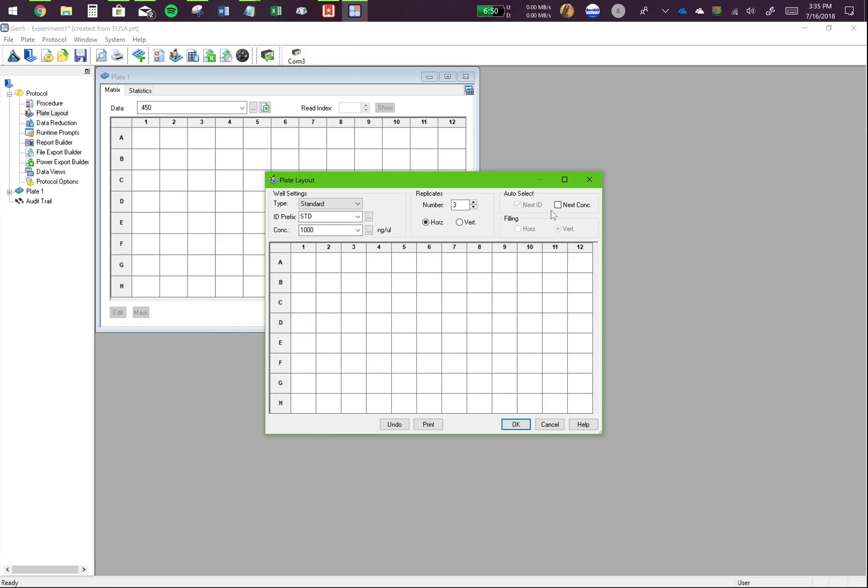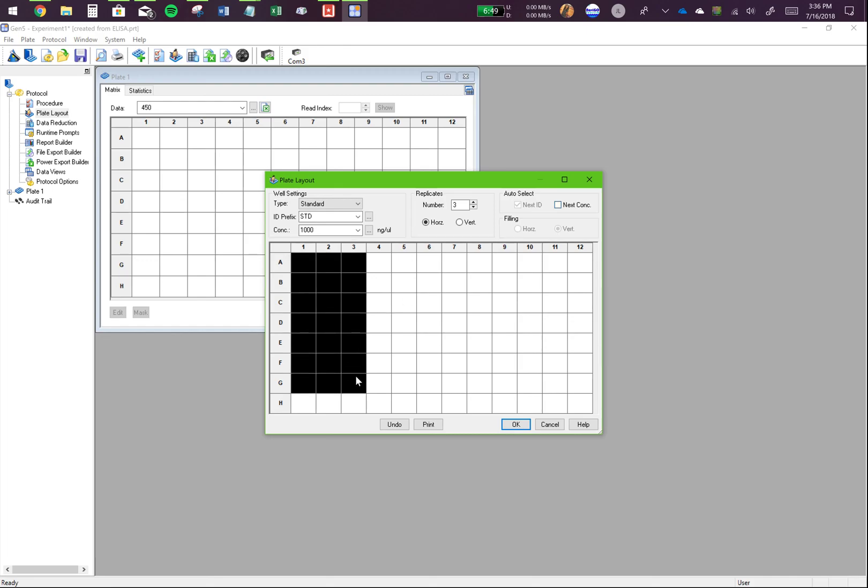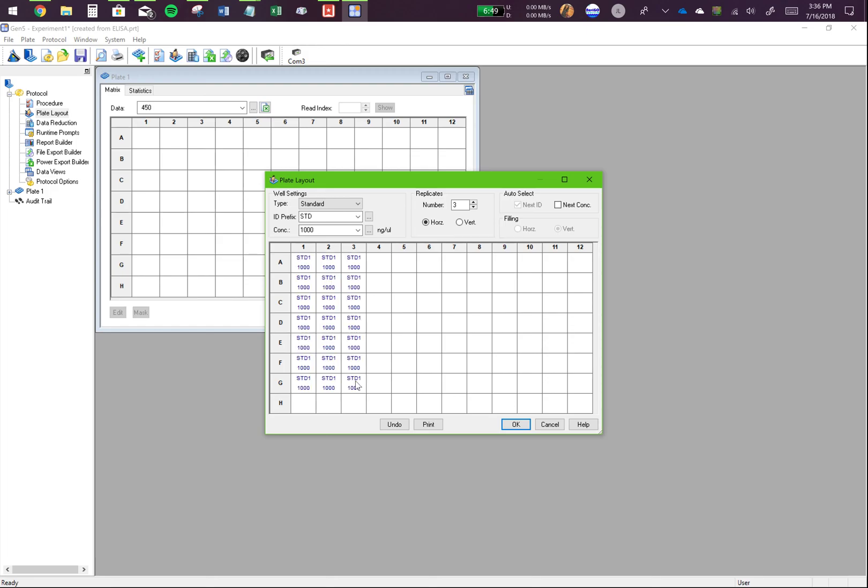The thing you want to make sure is you have the next concentration clicked in. If you do not click on next concentration, if I add these, if I add the standard here, it will just put the first standard in all of these wells and you don't want that.